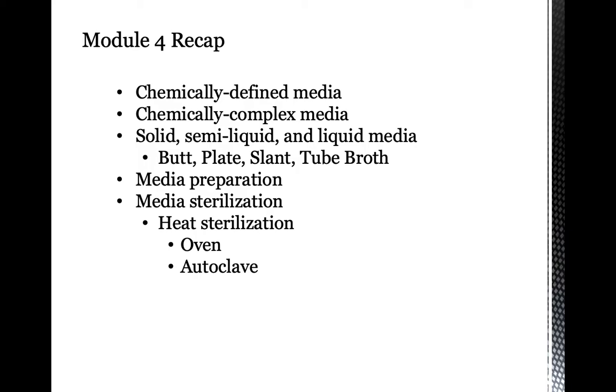Then for the oven, in the virtual laboratory, you will discover how different oven sterilization is compared to autoclave sterilization. There are obvious differences, or there will be expected differences, in the quality of the medium that is sterilized via the oven and via the autoclave. Okay? So much for the recap for module number 4.